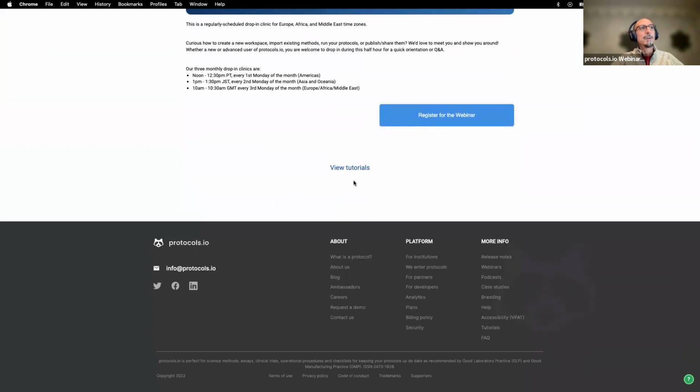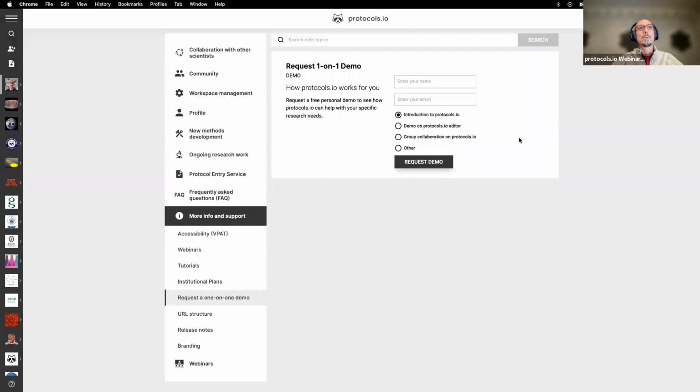We also have a series of pre-recorded tutorials that explain with short videos different tools and functionalities of Protocols.io. And finally, if you scroll all the way down to the bottom of the page, you will find a link to request a one-to-one demo. These are about half an hour, and you get to talk to one of us. You can share your screen, we can share our screen, and have a very interactive conversation about the questions that you might have.